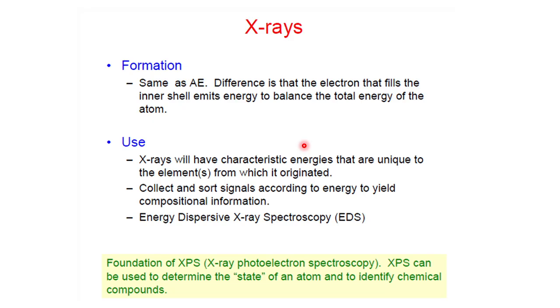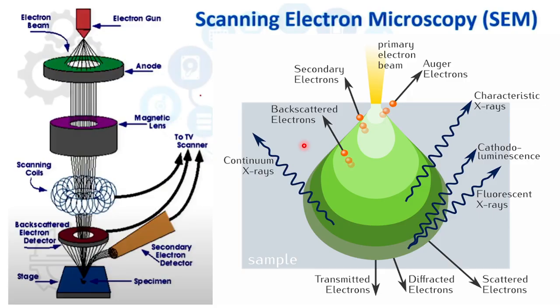That is the difference. How that energy is compensated depends on element to element, whether it will generate X-ray, fluorescence type of radiation, or Auger electron. It depends on element to element. So that's why you are getting different X-ray fluorescence, cathodoluminescence. These are all from your sample, depending on how that surplus energy is compensated.